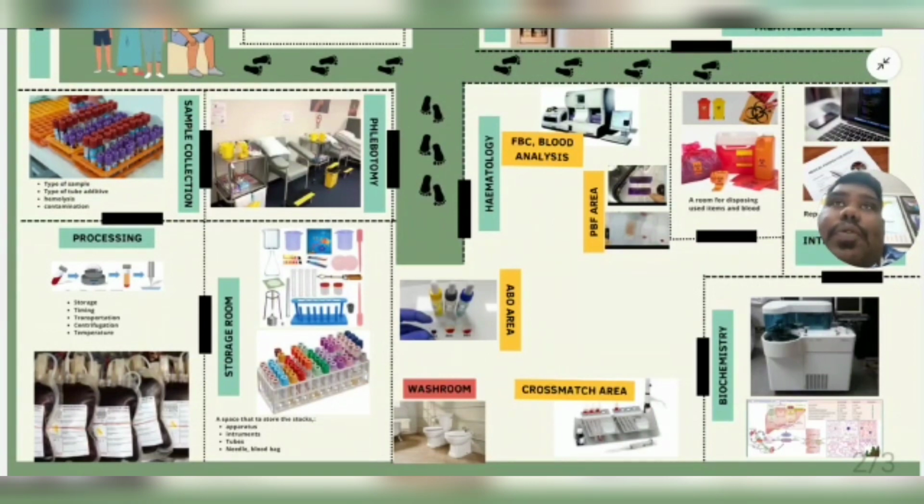So we need a centrifuge, and the centrifuge must be calibrated, and every morning we must check the speed and the time. That is the quality control we must emphasize in every lab, so we get a precise and accurate speed, and the blood will be centrifuged at the proper and correct speed as well.